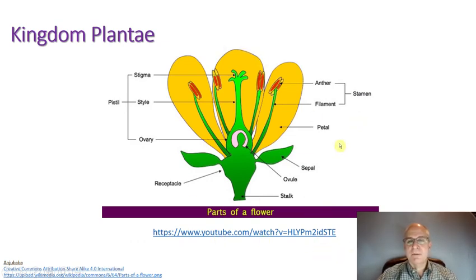So here you see a typical flower. We've got things like the petals, which we said again are often brightly colored and going to be used for attracting pollinators. We have these modified leaves that are going to help protect the flower when it's still a bud, called a sepal. And then we've got the male and female parts of the flower, which you in this case find in the same flower.